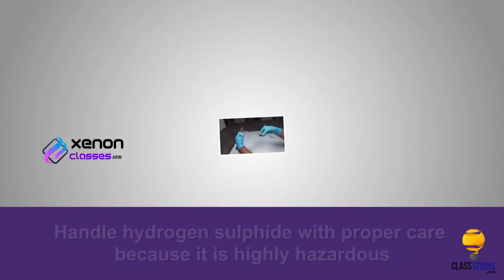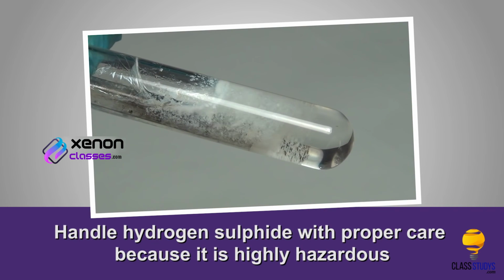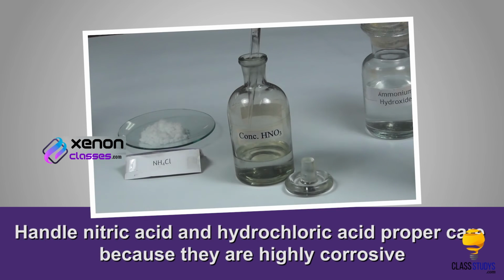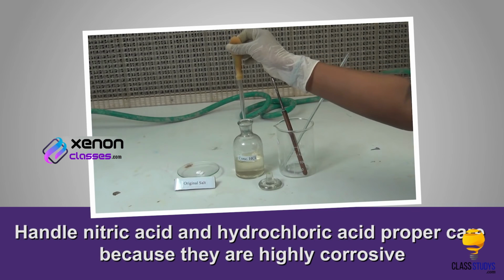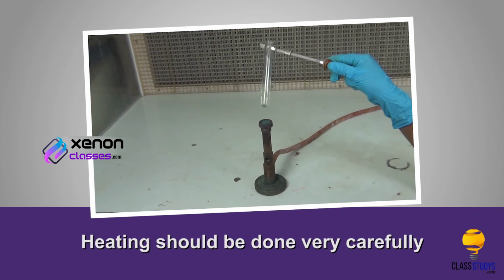Precautions: handle hydrogen sulfide with proper care because it is highly hazardous. Handle nitric acid and hydrochloric acid with proper care because they are highly corrosive. Heating should be done very carefully.